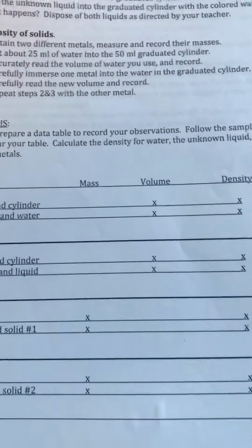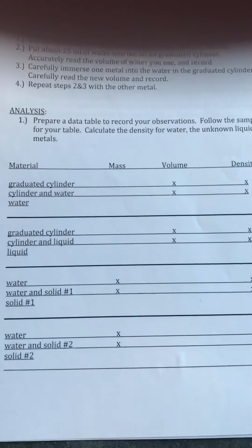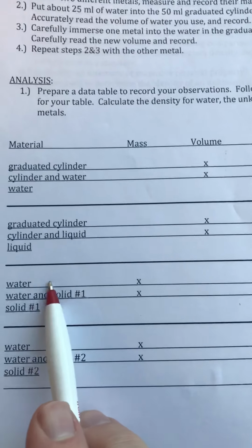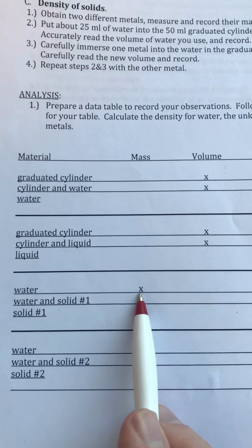All but one. I'll explain that in just a second. So you're doing that. Fill this data table in. And let's take a look at one of the solids. Down here, we had the solid, the water. You don't need the mass of the water when doing water displacement.